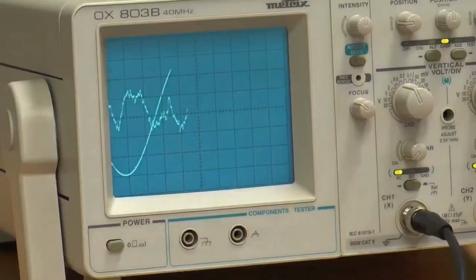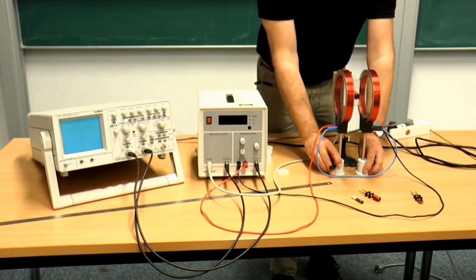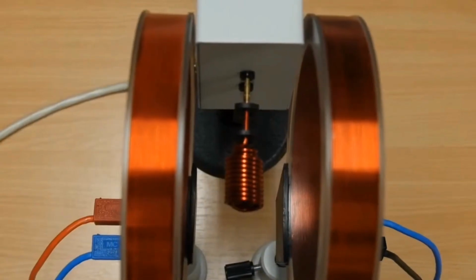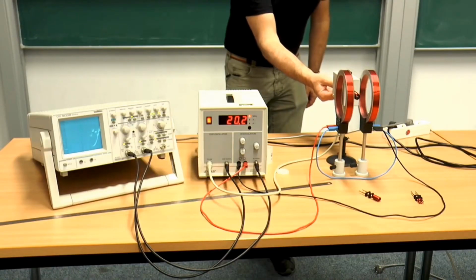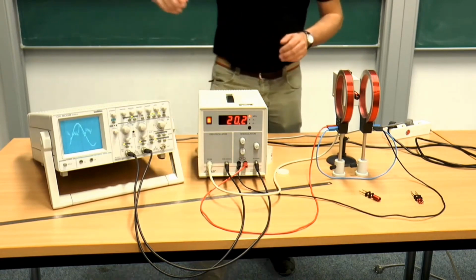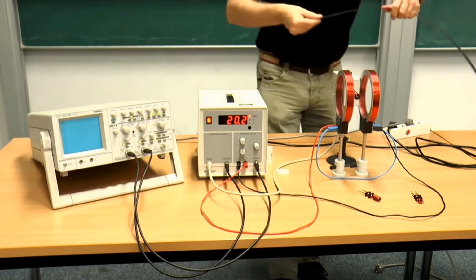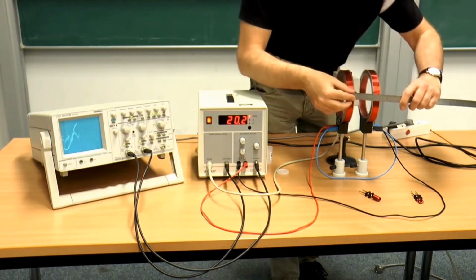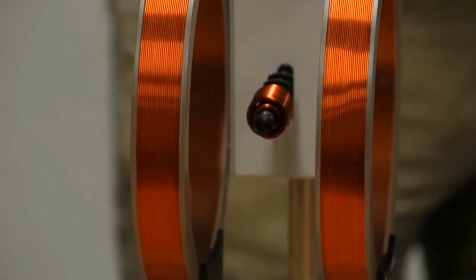In this video, we will show how we can use ESR instruments. The two coils making up the Helmholtz coil have to be connected with each other and the ESR operating unit. The coils are placed at a distance of 6.8 cm from each other. Then the resonance coil, which is used for the frequency range, is inserted into the LC circuit operating unit. Next, the sample has to be inserted into the resonance coil and the whole setup placed in between the Helmholtz coil. Connect the LC operating unit with the ESR operating unit and then connect the latter with the oscilloscope. Turn the knob on the side of the LC operating unit to achieve maximum gain to get a clear signal.